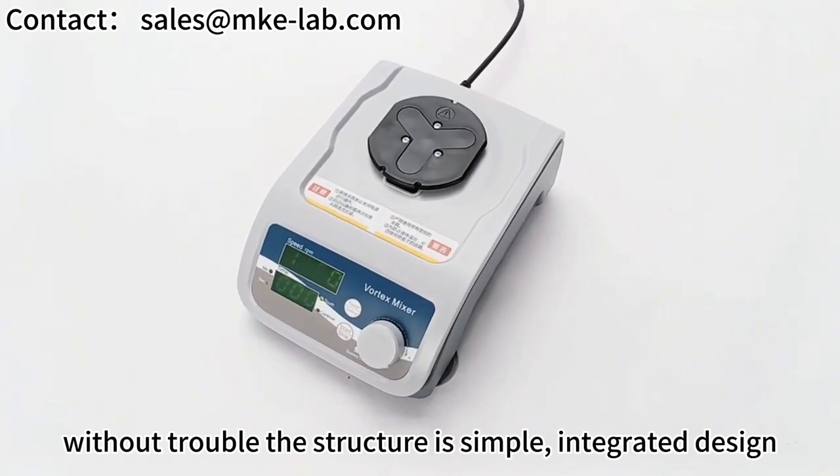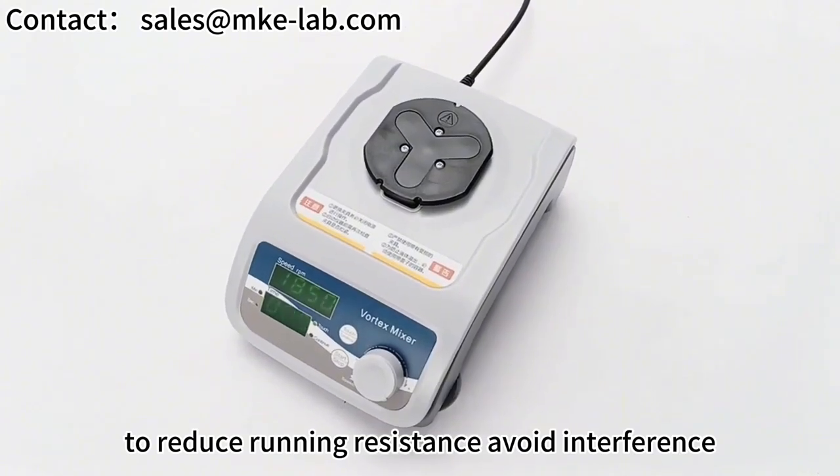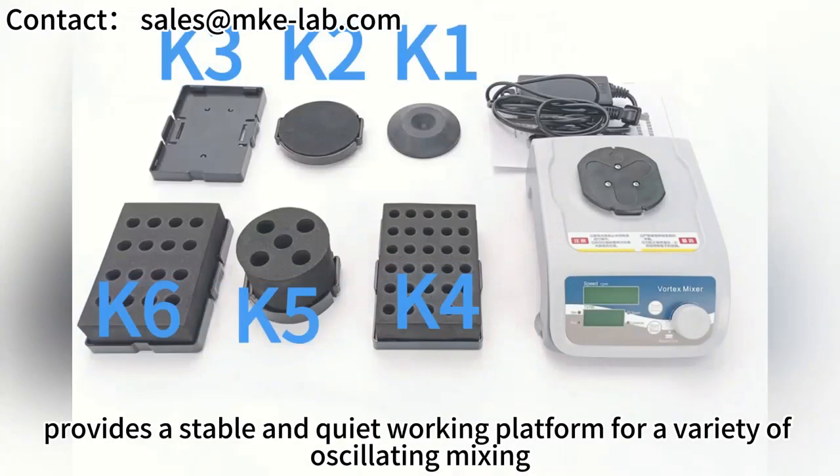The structure is simple with an integrated design, with enough counterweight and eccentric balance operation to reduce running resistance and avoid interference. This provides a stable and quiet working platform for a variety of oscillating mixing applications.